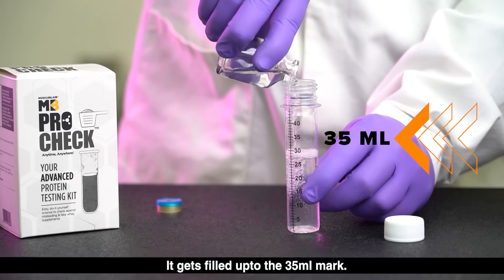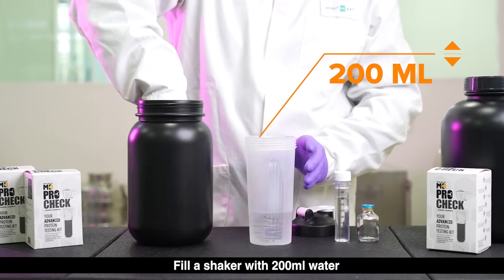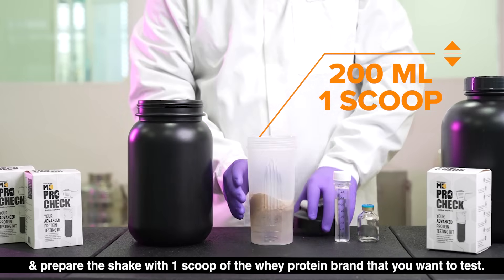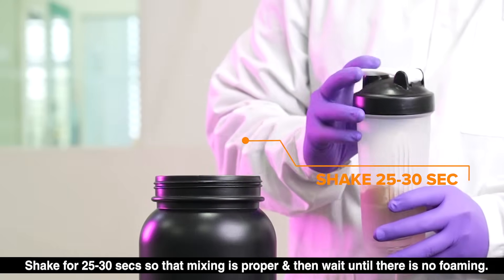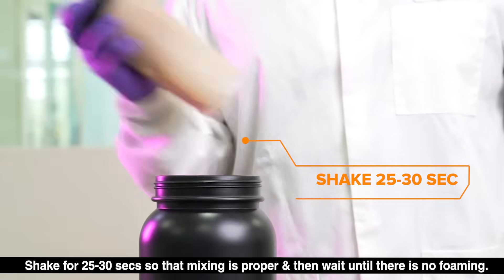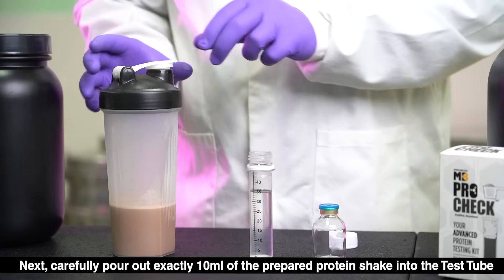The test tube gets filled up to the 35 ml mark. Fill a shaker with 200 ml water and prepare the shake with one scoop of the whey protein brand that you want to test. Shake for 25 to 30 seconds so that mixing is proper, and then wait until there is no foaming. Next, carefully pour out exactly 10 ml of the prepared protein shake into the test tube.